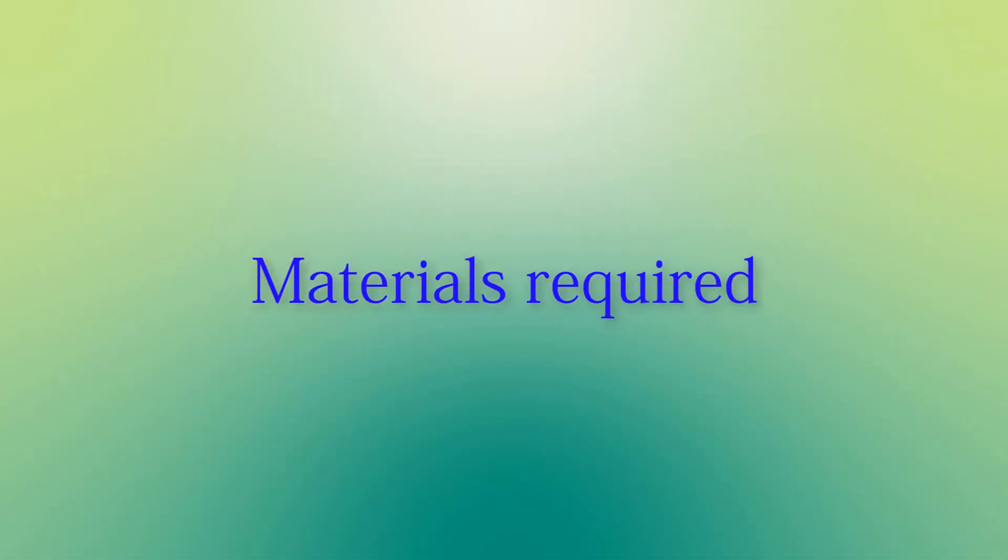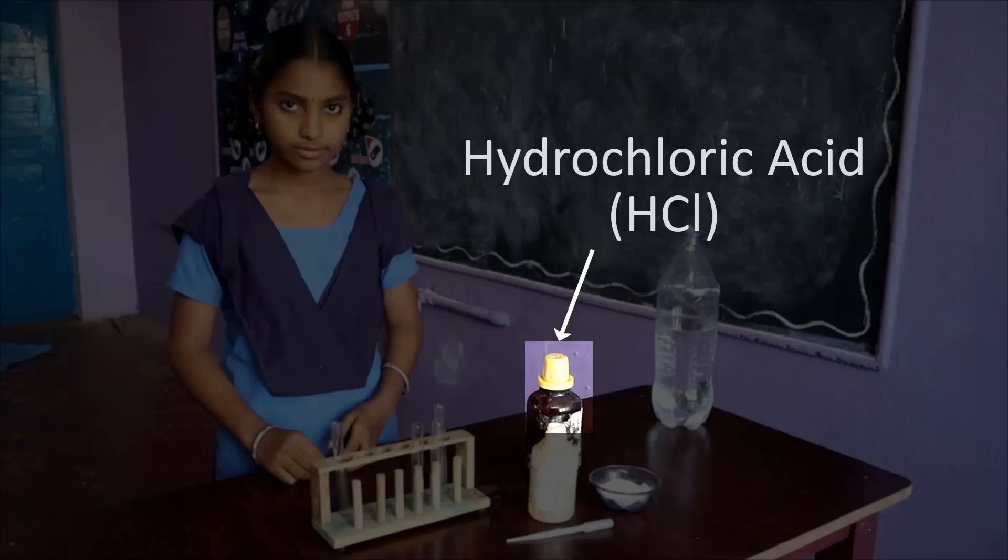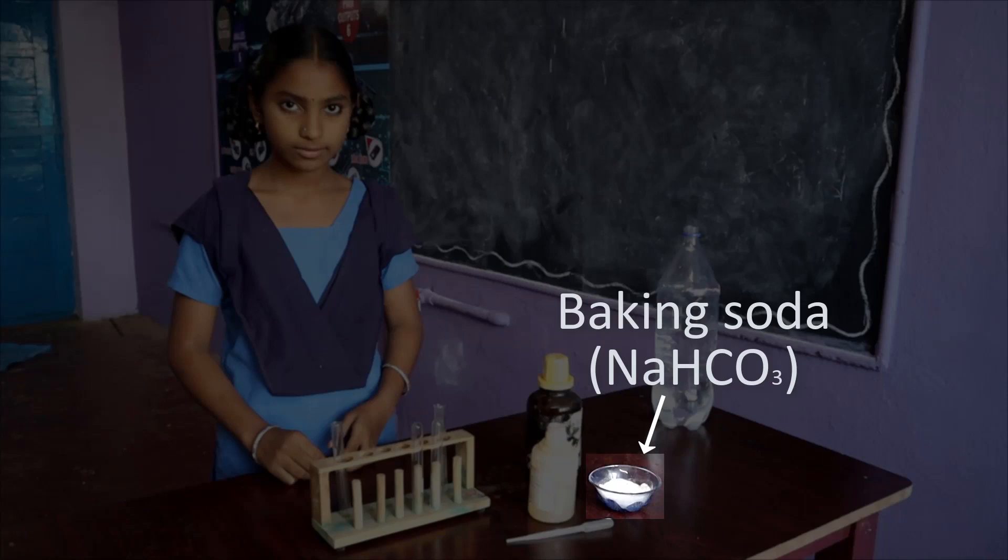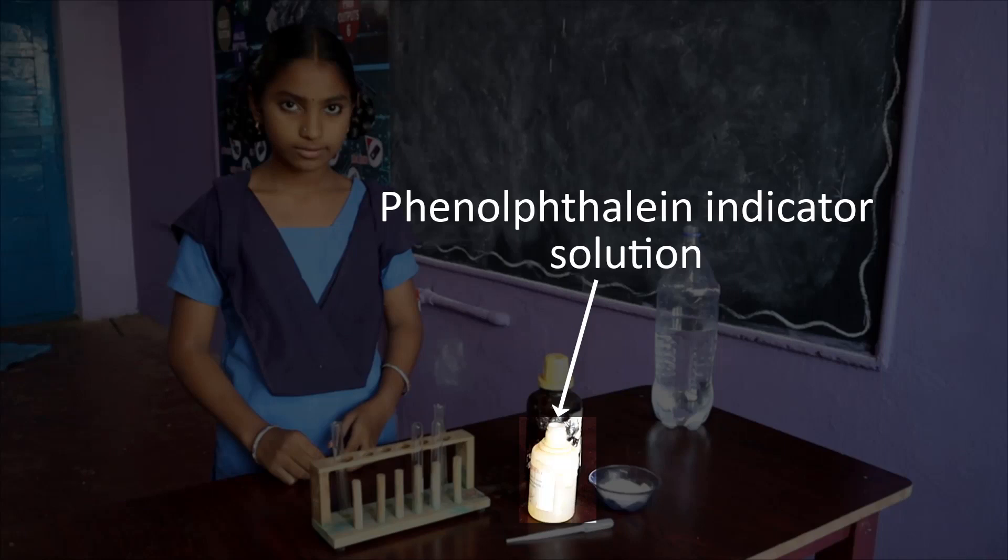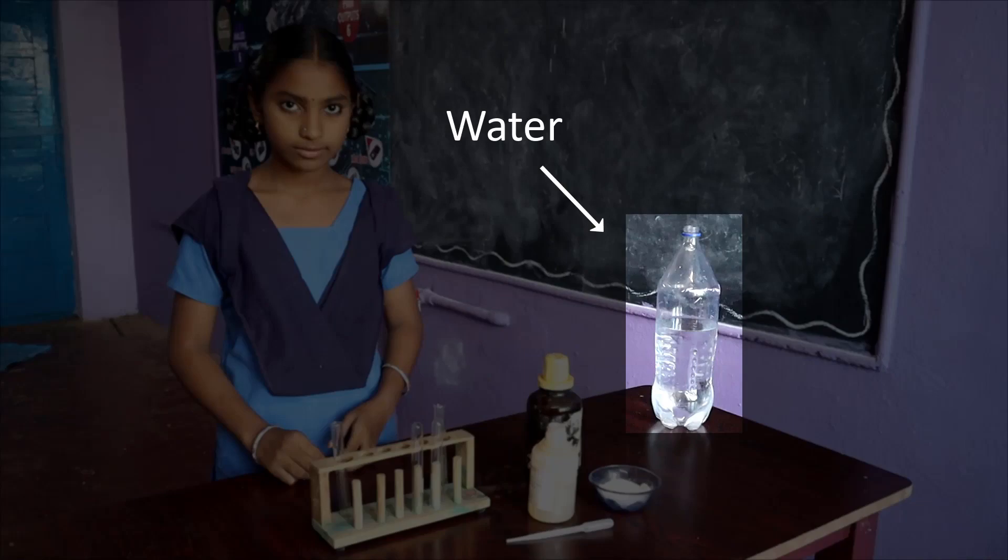Materials required: hydrochloric acid (HCl), baking soda (NaHCO3), we can use caustic soda (NaOH), phenolphthalein indicator solution, test tubes, dropper, and water.